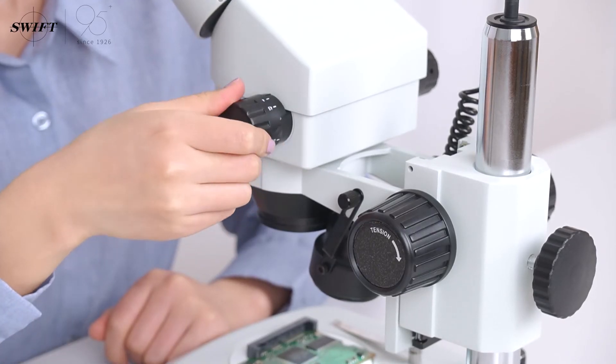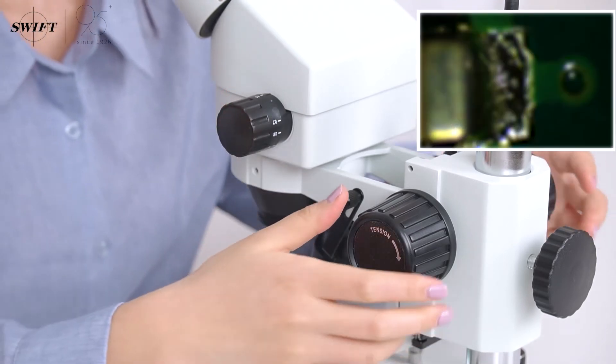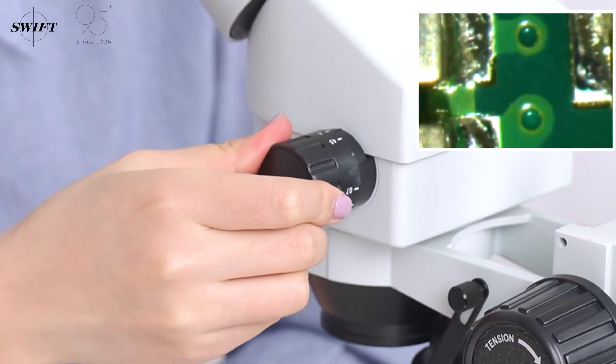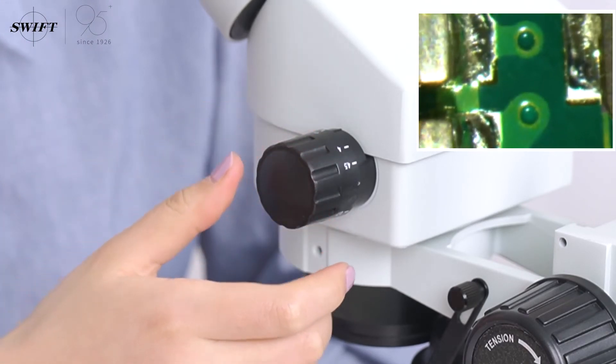Rotate the zoom handle to high magnification and use the focusing hand wheel to adjust the image clearly. Switch the zoom hand wheel to observe the image under the microscope.